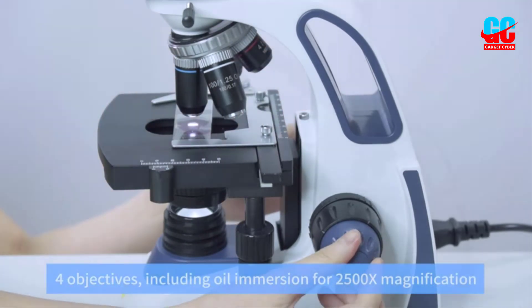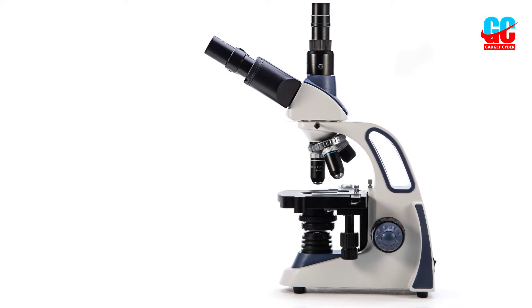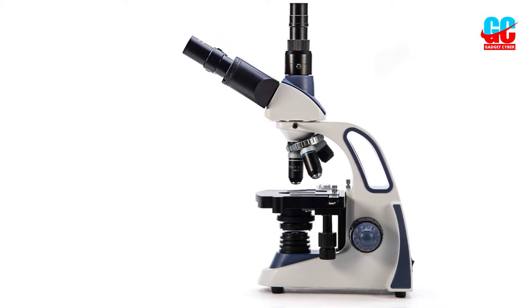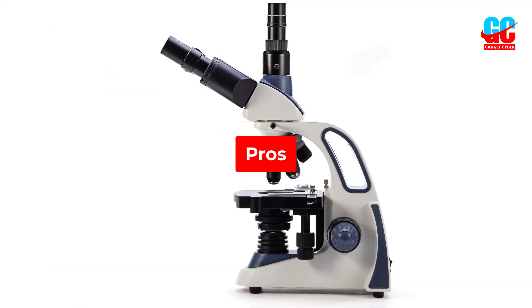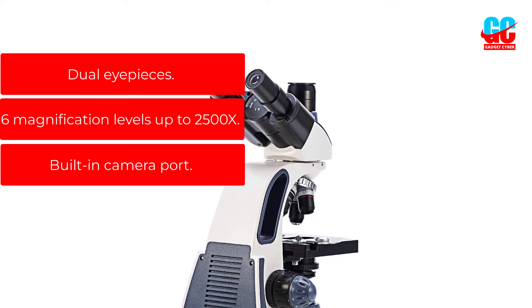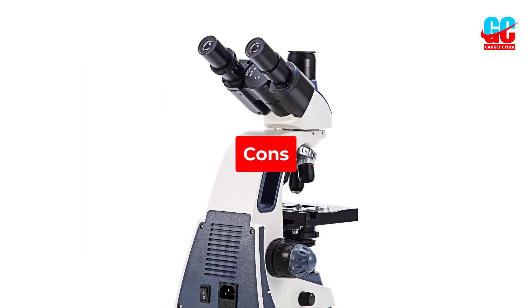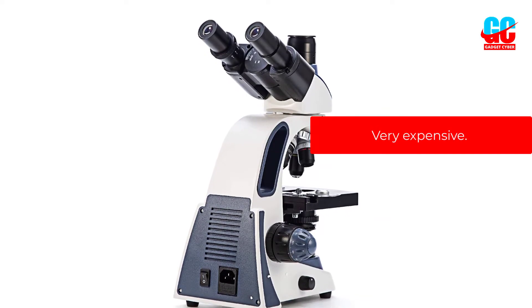We also appreciated the addition of the camera port, which allowed us to take pictures and videos of what we were seeing. Pros: Dual eyepieces. Six magnification levels up to 2500x. Built-in camera port. Cons: Very expensive.